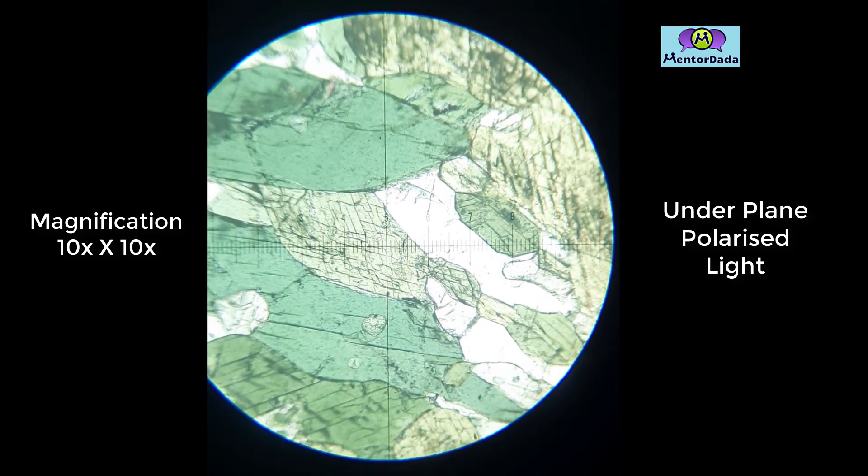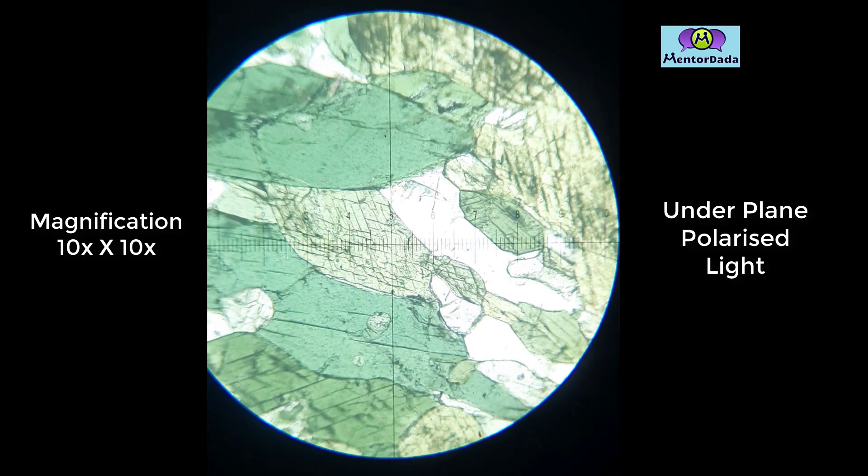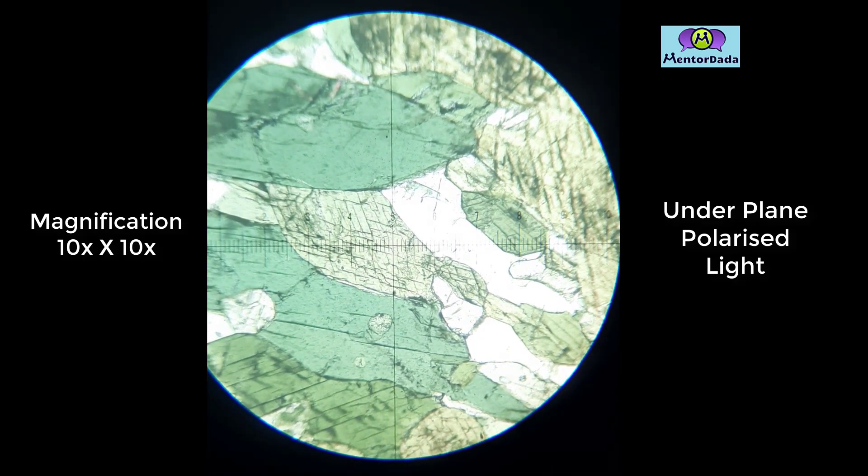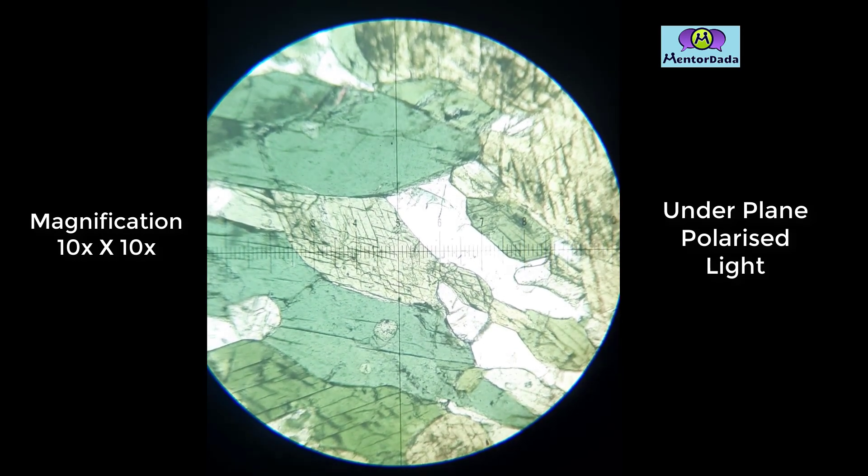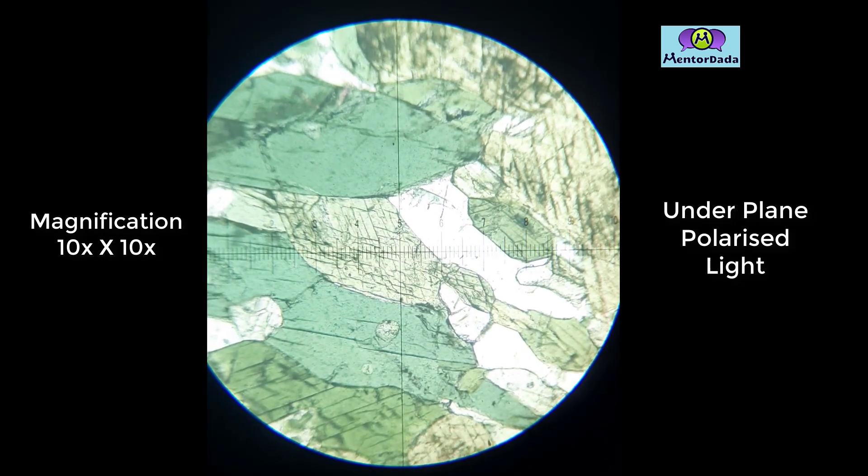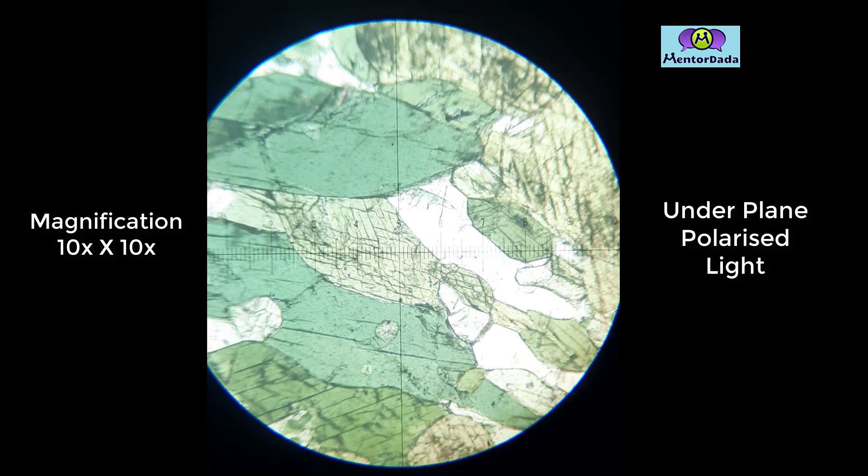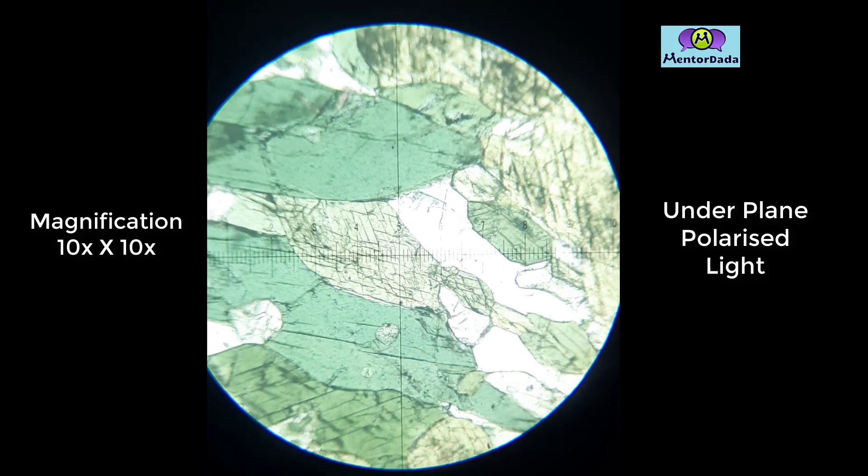Refractive index relief is quite high and the outline is prominent, so the refractive index of this mineral is high.